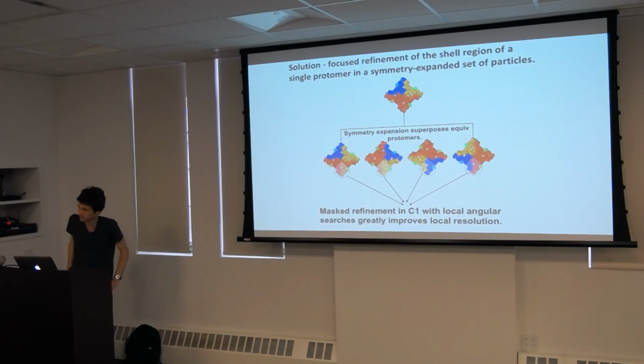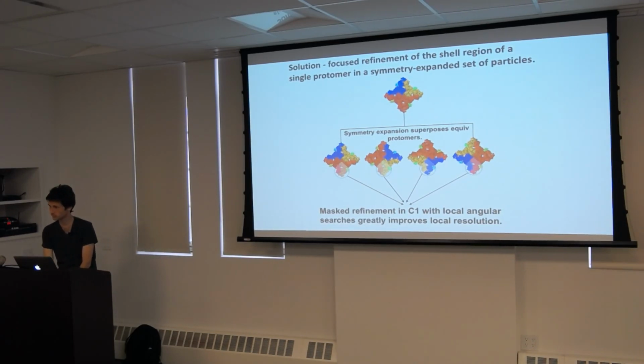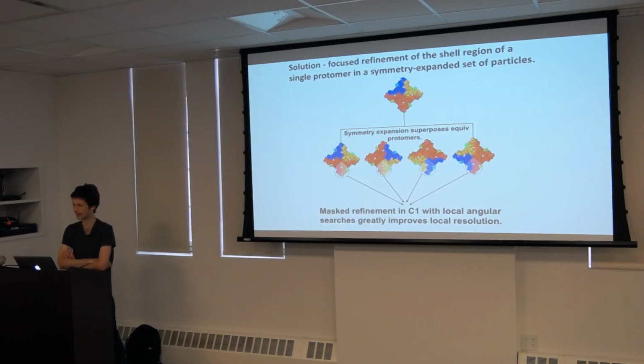Yeah. So you mentioned using EM Ringer and MolProbity as validation tools. For Ramachandran angles and rotamers, I'm not really sure, but I think they look at high resolution crystal structures for statistical outliers. That's right. Given all the improved resolution in EM maps, do you think there'll be a version of that based on EM data at some point, and do you think it'll be different? I don't know. I would doubt that it would be different necessarily, but certainly once there are sufficient higher.